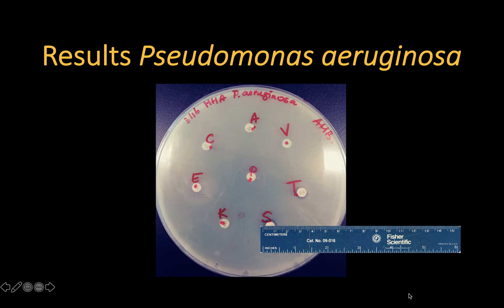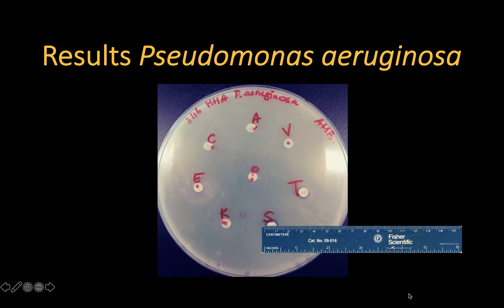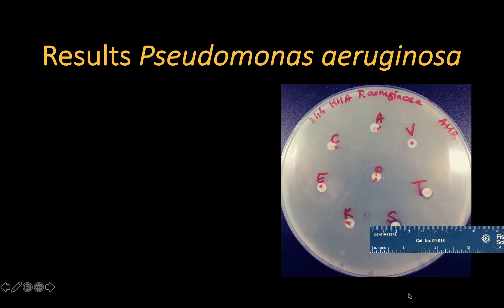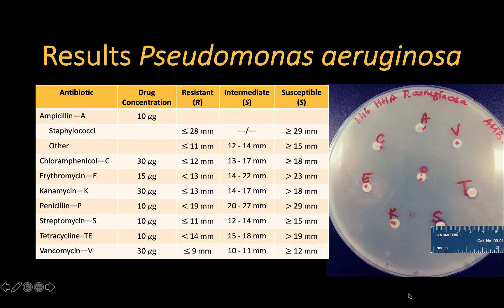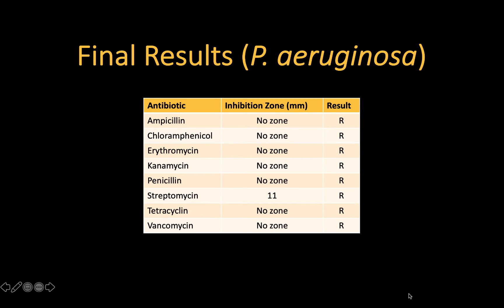Here is an example of a Kirby-Bauer test performed on the gram-negative bacillus Pseudomonas aeruginosa. Pause the video to determine the sizes and interpret with the table. Do these interpretations match your own?